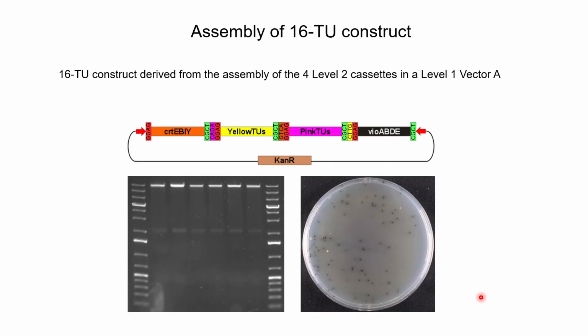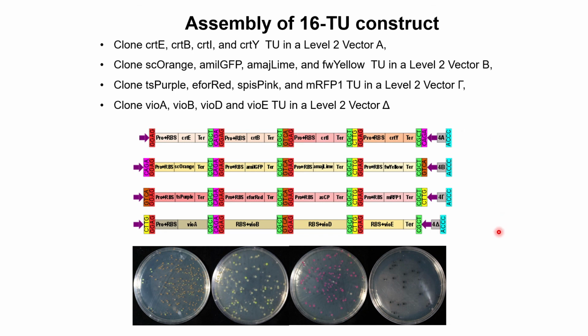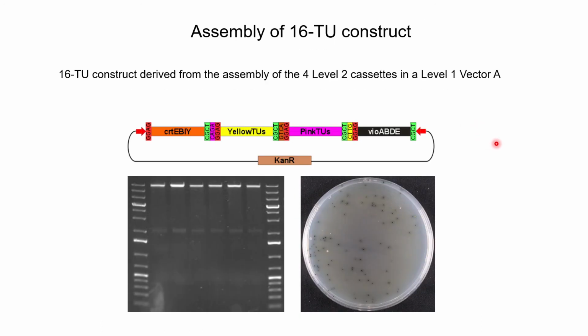In a second step, we combine all of these four vectors with the genes back to a level 1 acceptor vector, and we make this big 16 transcriptional unit construct, comprised of carotenoids, chromoproteins, and violacein. When we transform the construct to E. coli cells, the colonies got this black color because the violacein production was dominant to the other colors. Also, verification of the construct was done by restriction digestion, showing the correct pattern on agarose gel.